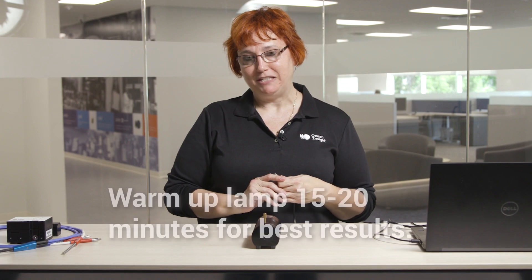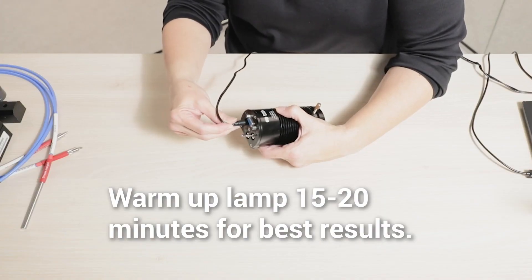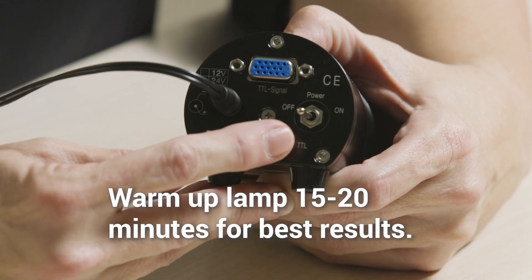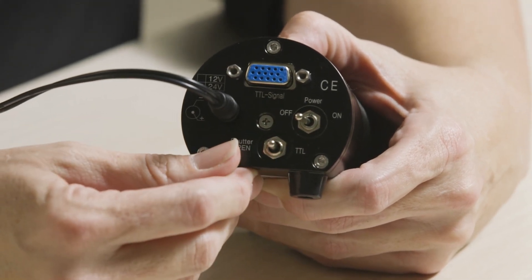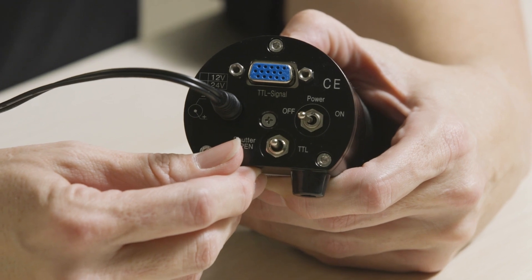The first step in our setup is going to be to plug in and get our light source ready for our reflectance measurements. So first, we're going to plug in. We've got a shutter, which will enable us to take our dark measurement without turning the light source off.